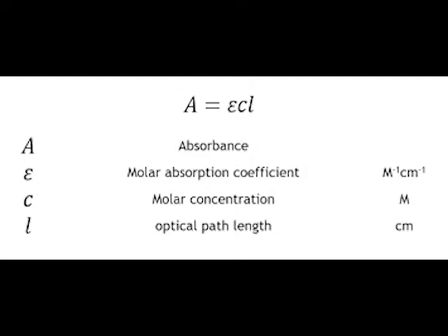Absorbance is determined by how much light is absorbed by the solution and is measured by the spec to the concentration of the solution because the amount of molecules affects how much light is absorbed. Concentration is determined by the molarity of the solution, which is moles per liter.